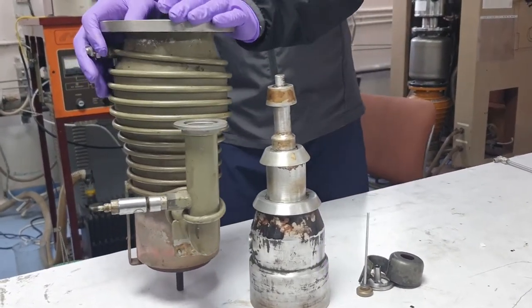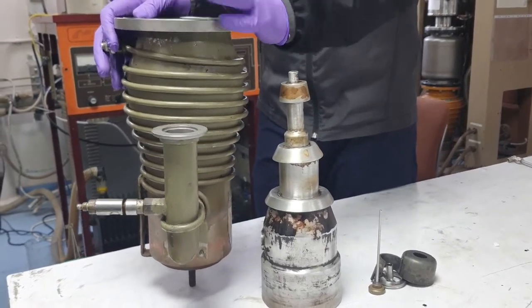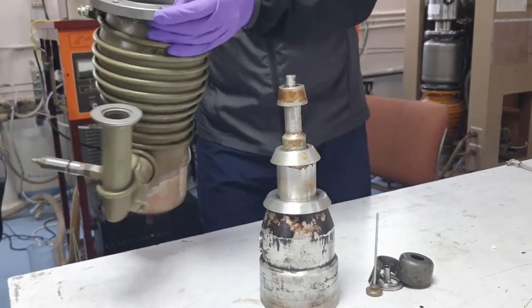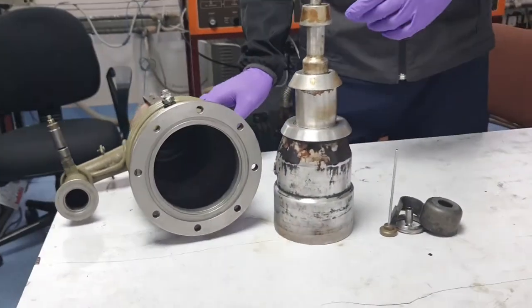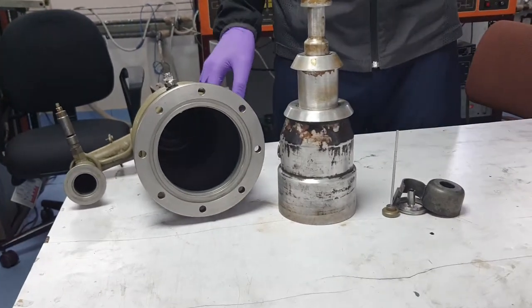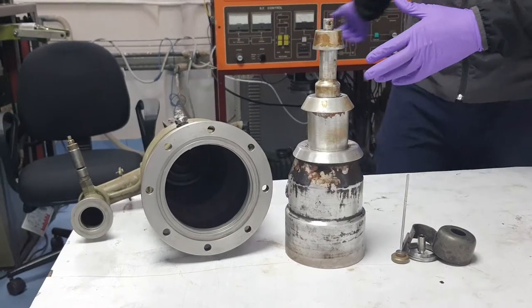Recently we have cleaned this diffusion pump using kerosene oil — or one may also use xylene — and after that cleaning we have wiped the residues with isopropyl alcohol, then dried it. Now we are going to assemble this diffusion pump for reactive ion etching.